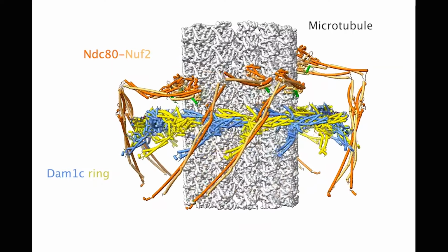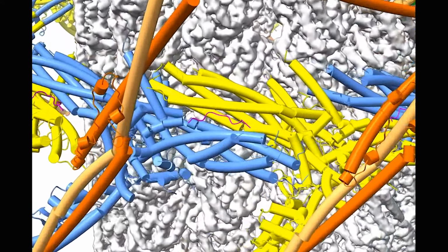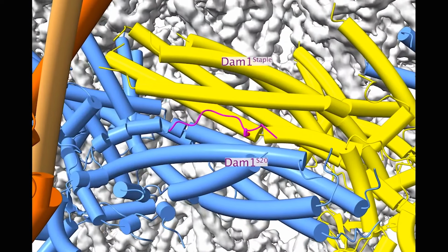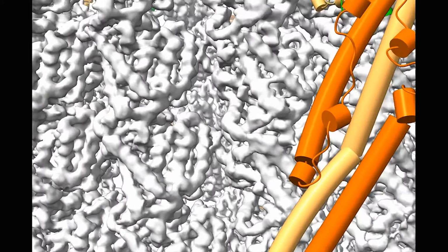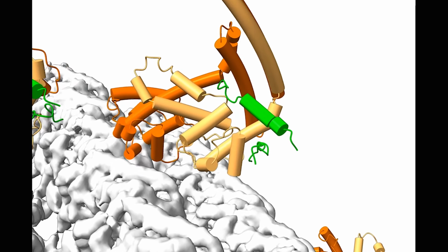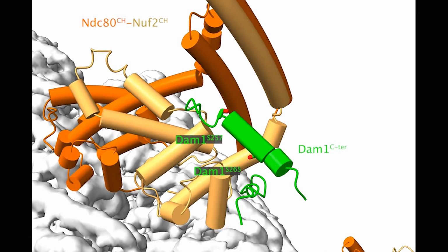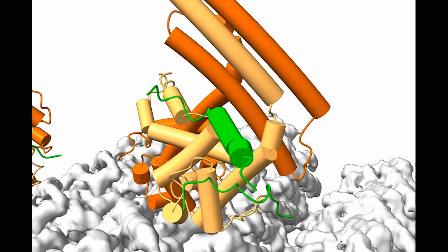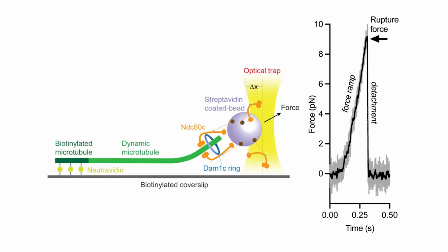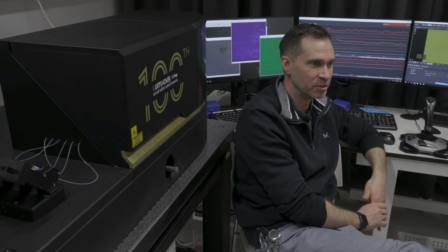A project that I've recently finished was working with David Barford's lab, where they'd done an amazing cryo-EM structure of the kinetochore. From their cryo-EM structure, they raised several questions where they'd seen interactions and they wanted to make mutants. When they made these mutants, on the C-trap we did single molecule studies where we measured the rupture force of the kinetochore from microtubules. That was a long-term project that took quite a few months to do. So it was amazing to be involved in such a great project.